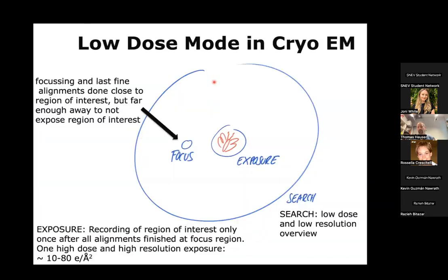So these are three different approaches. The bigger advantage again of this spraying device is you need orders of magnitude less sample. So if you have a difficult to prepare sample, that might be a good idea. No matter which of these three approaches you use to prepare your cryo samples, the next steps are all the same.